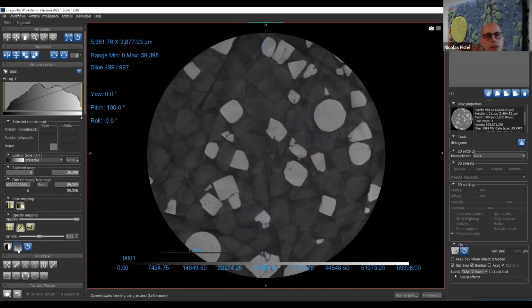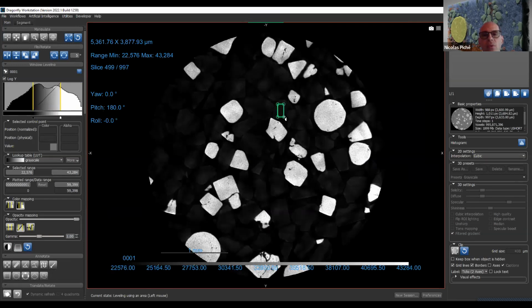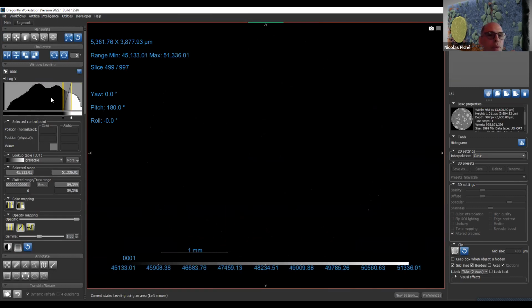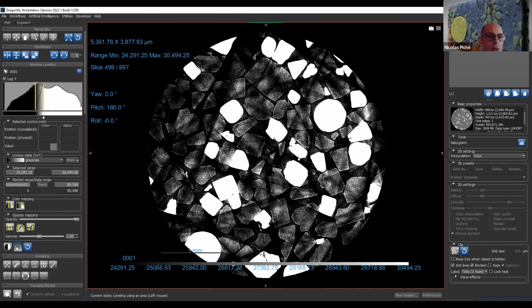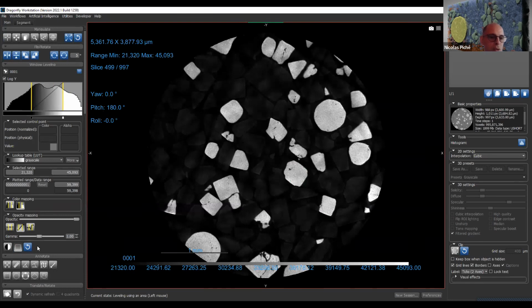You select this, it's what we call the area window leveling. If I want to optimize the contrast for that region, I do it like that. So now I have full contrast in that region. I see nothing else. If I do it like this, I see that. As you see, depending on what I select, I enhance different parts of the signal. It's equivalent to taking that and moving it, but it's more intuitive. You look at the object, you want to enhance and see the detail of the tone of green in that region, you do that.